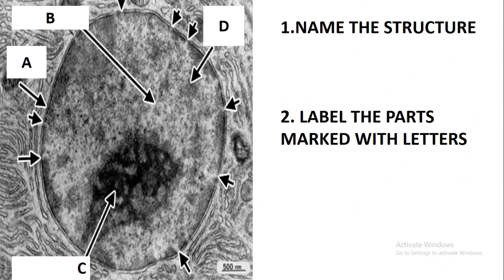If you watch part 12 of our histology revision, you find that the same structure was shown, but in our case, it was not labeled. But in this case, we are now labeling it. So this structure is just the nucleus.